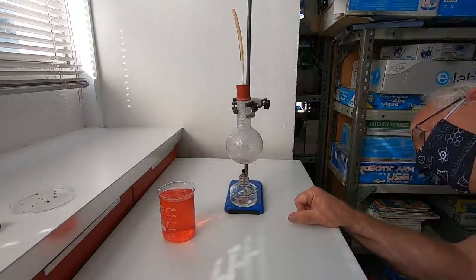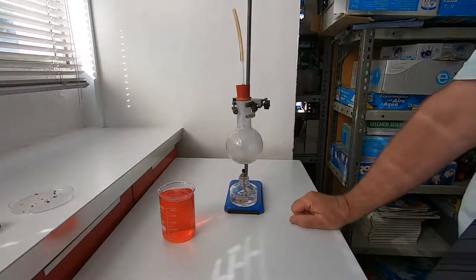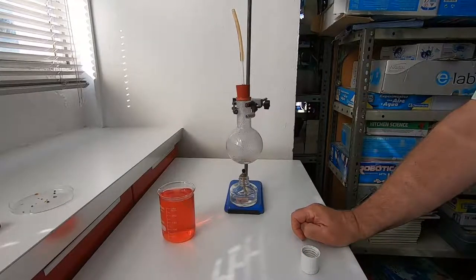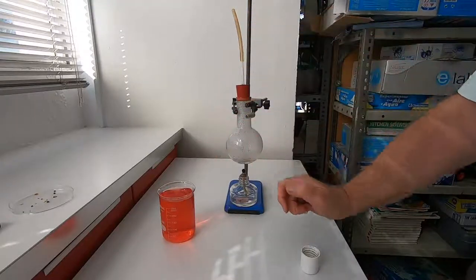I just want it to boil for a bit — it's boiling quite nicely actually. What I'm going to do in a second is put the top on to turn it out so the flame goes out, and then I'm going to tip this upside down and put it into the water.